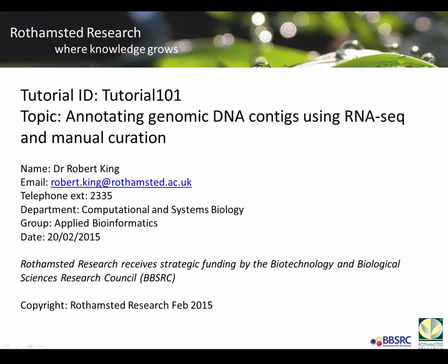Welcome. This is a tutorial on how to map RNA-seq data to a genomic DNA sequence to correct or add a gene annotation based upon RNA-seq data. Say you had extended a particular contig in wheat which you want to see if there was a gene on it, or you had a set of contigs in which you want to correct their gene annotations. What you can do is map RNA-seq data and then manually correct the annotations to make sure they're correct.